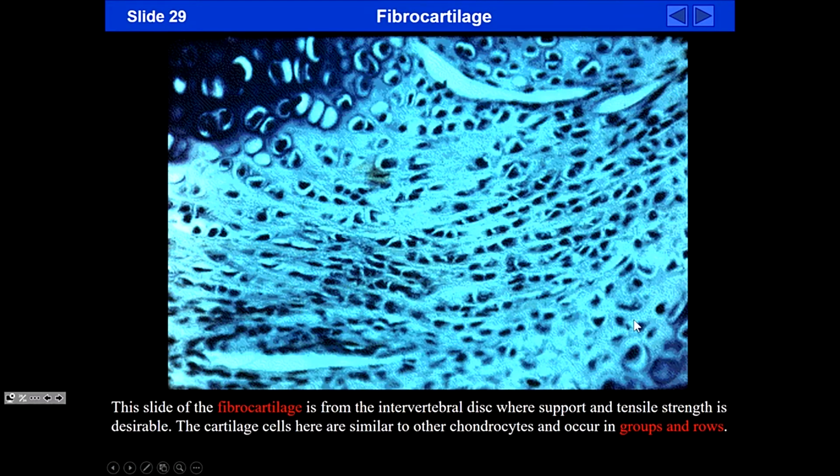And fibrocartilage, our third and most unique and distinct form. You can see the long chains of cells, arranged along lines of stress. These long chains of cells are the histologically unique, defining and distinguishing feature of fibrocartilage as opposed to hyaline or elastic cartilage. Perhaps one of the easiest to identify because of the presence of the cells in long chains.